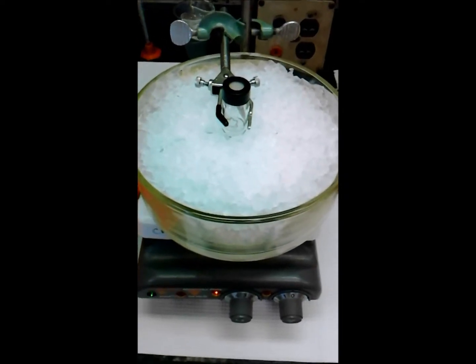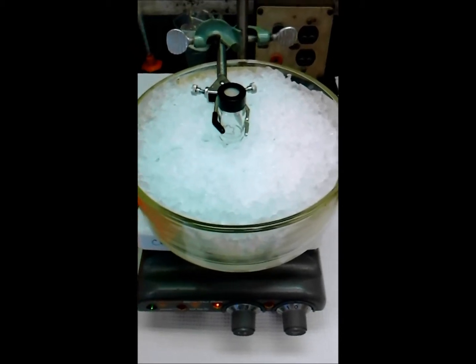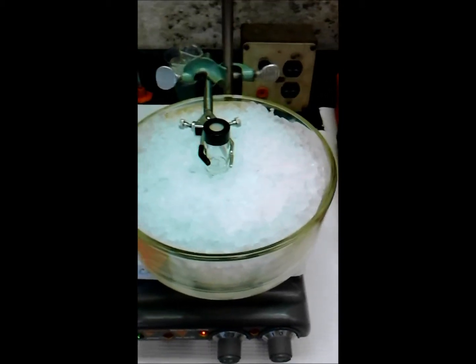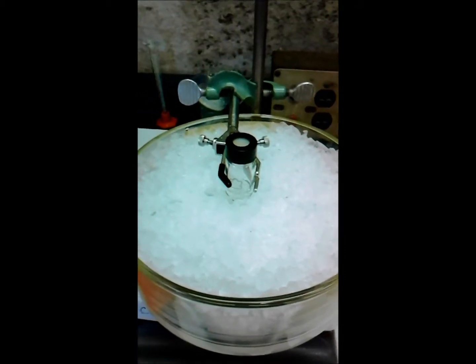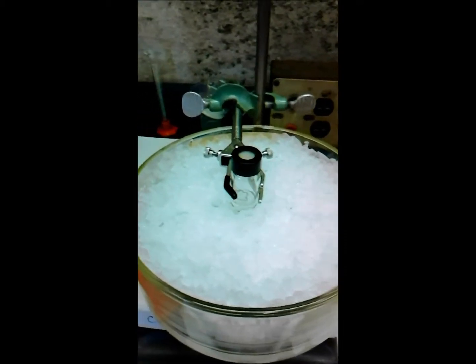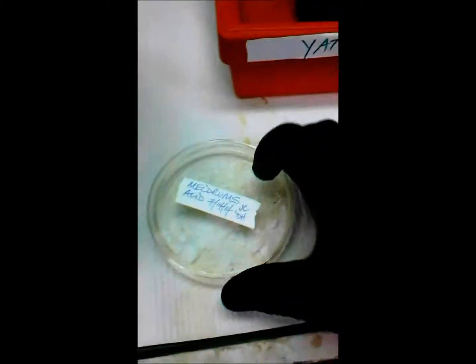Alright, so I'm setting up an acylation of Meldrum's acid reaction for the first intermediate in our synthesis. I'm doing this on the microscale, a 500 milligram scale, just as a pilot reaction to see if the acylation works. We have some recrystallized Meldrum's acid that we recrystallized from acetone over the previous couple of days.